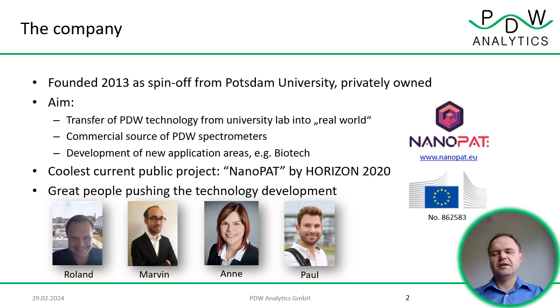world. Our coolest current public project is called the NanoPAT. It's an EU project with a lot of industrial partners, actually from the chemical industry. And here we look mainly into particle sizing, nanoparticle sizing during processes. Of course, the company is only as good as the people working for it. We are luckily having a small but very cool team to push forward the technology development.